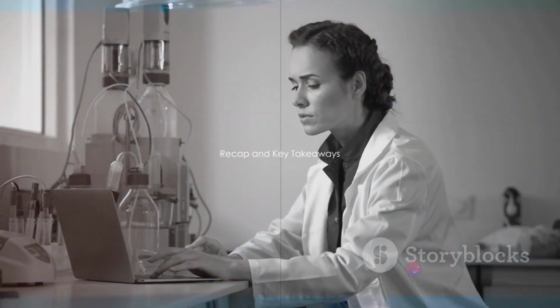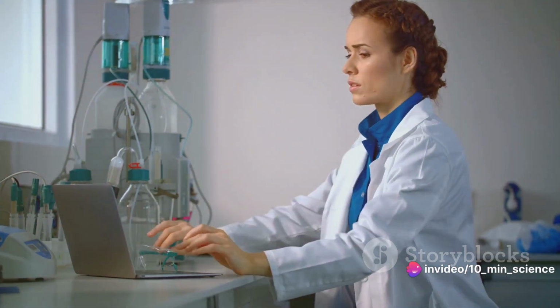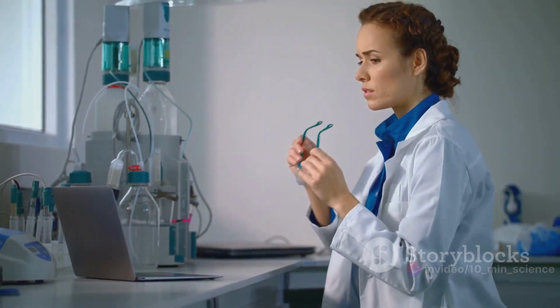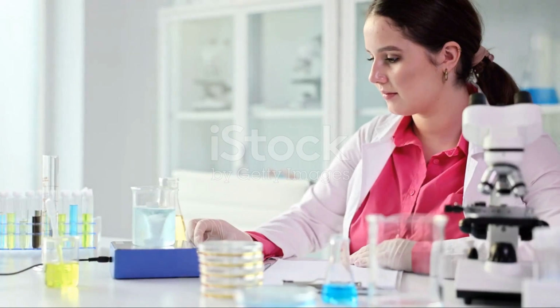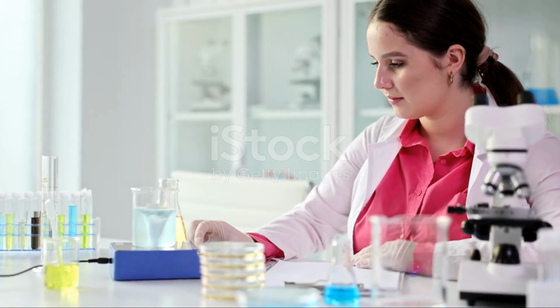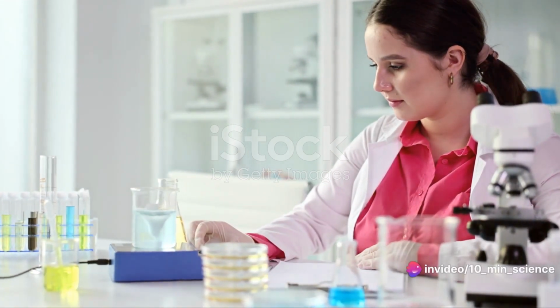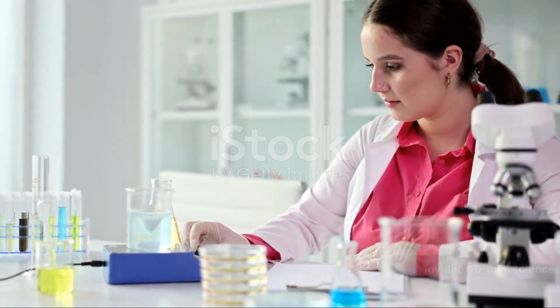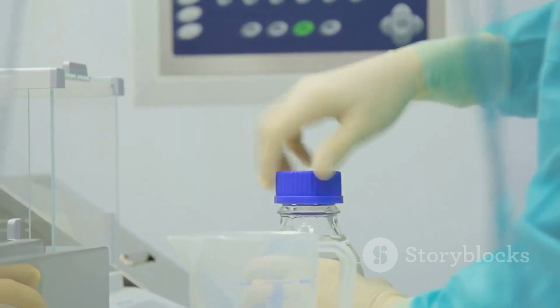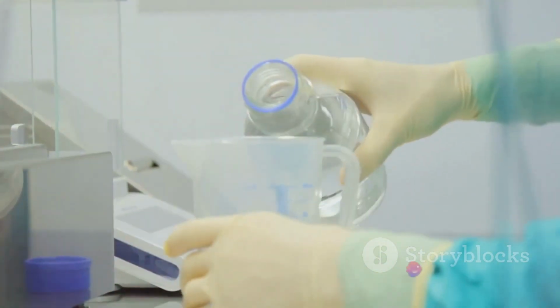So, let's summarize what we've learned about internal standards in HPLC. High-performance liquid chromatography, or HPLC, is a powerful tool in the world of analytical chemistry, and internal standards are the unsung heroes that ensure our results are accurate and reliable. We've delved into the complex world of HPLC, and we've discovered that internal standards are not just a luxury, but a necessity. We began our journey by demystifying internal standards.